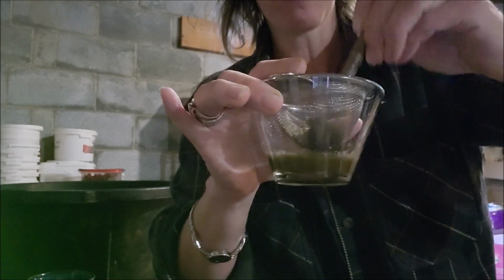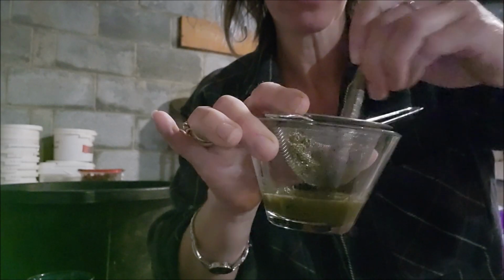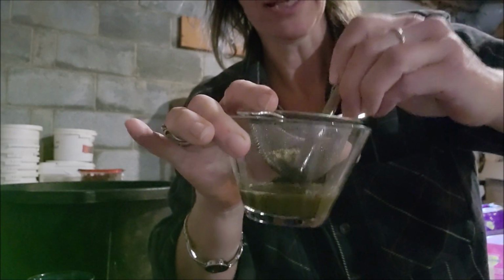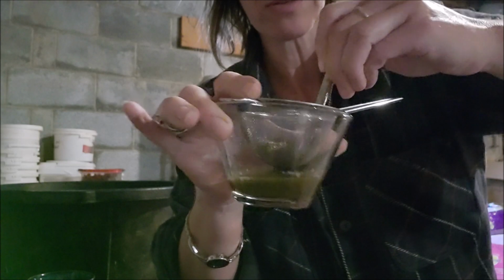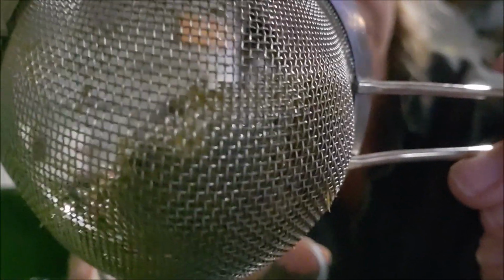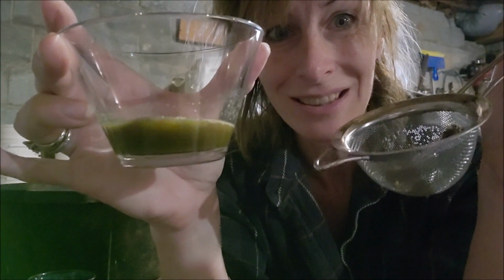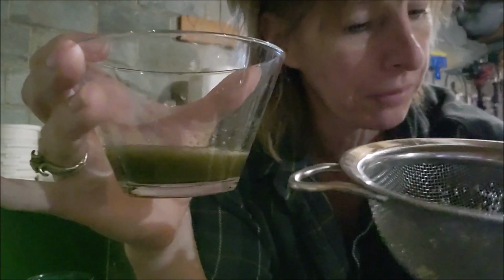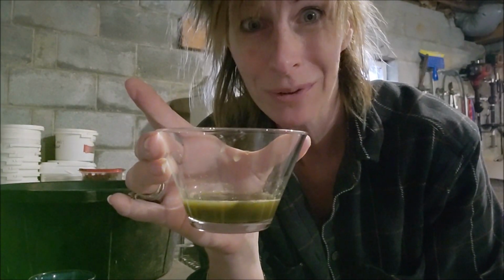So you have three types of shedding. You have light shedders, medium shedders, and heavy shedders. A light shedder is under 500. A medium shedder is over 500 to 1,000, and then the heavy shedders are over that. So now we have this very dry little poop ball in here, and we have, hopefully, eggs in there. So we're going to let this sit for a bit and allow the eggs to float. There's a fly in here. So I'm going to let this sit for about 5 minutes and I will be right back with you guys.